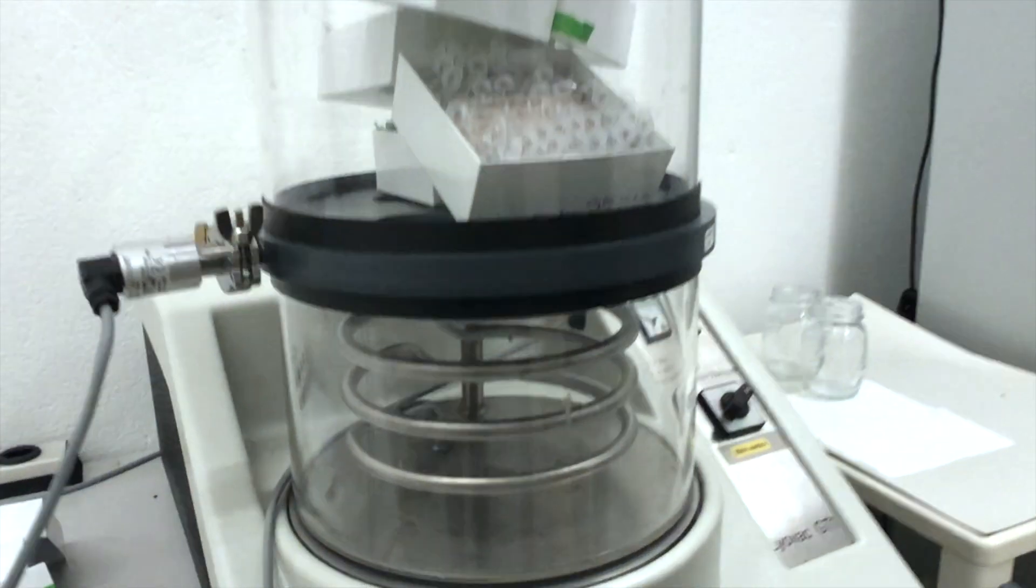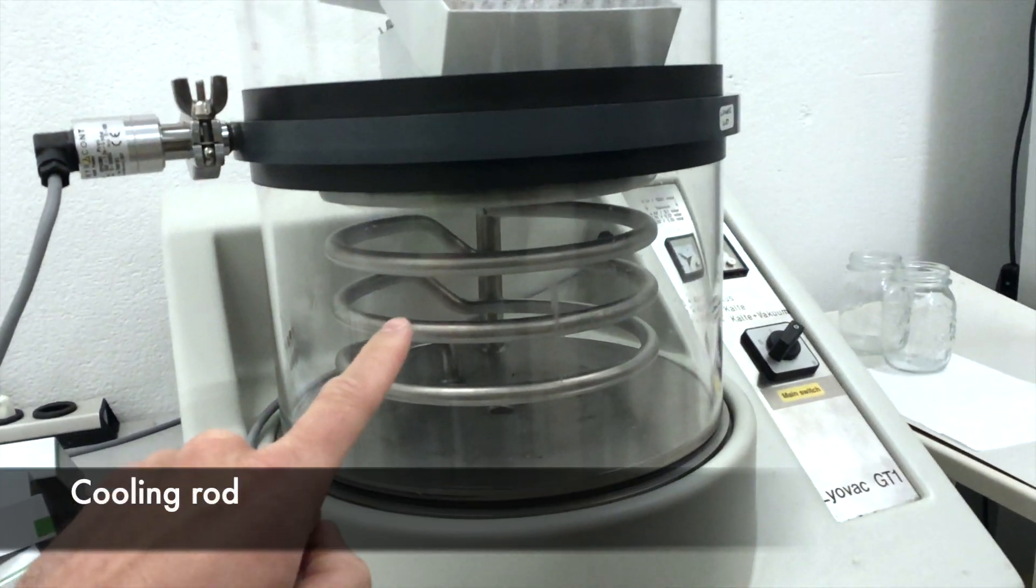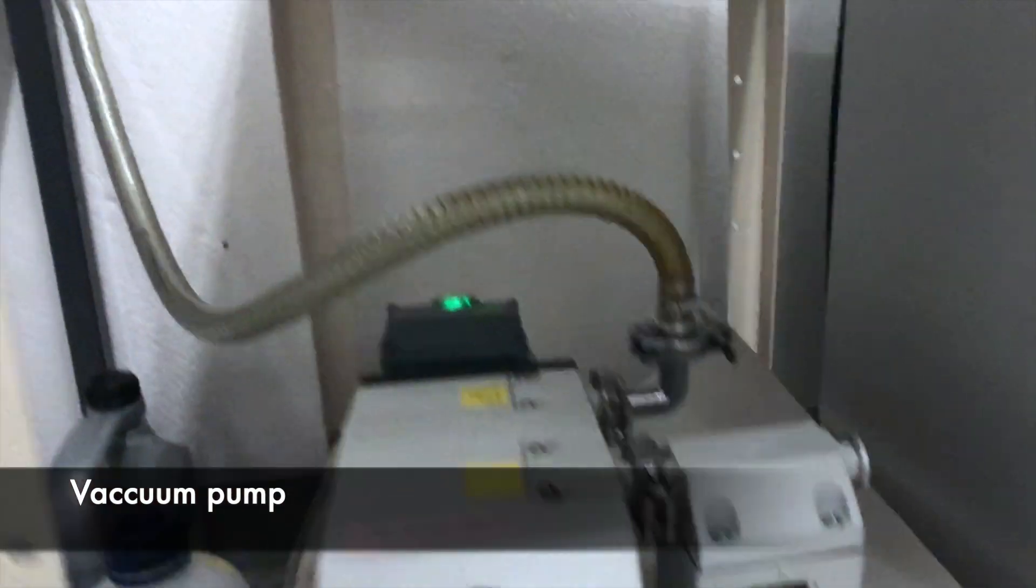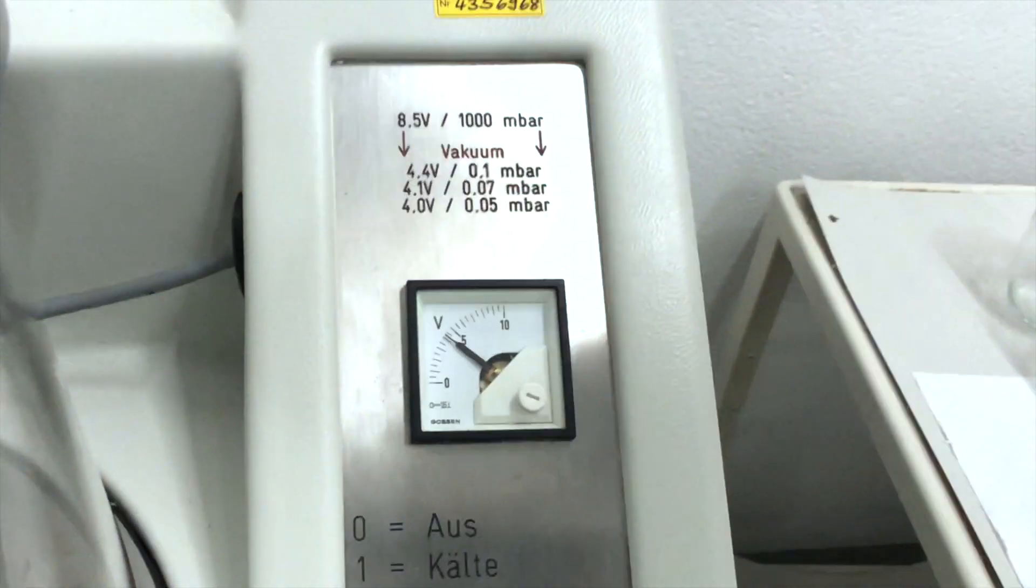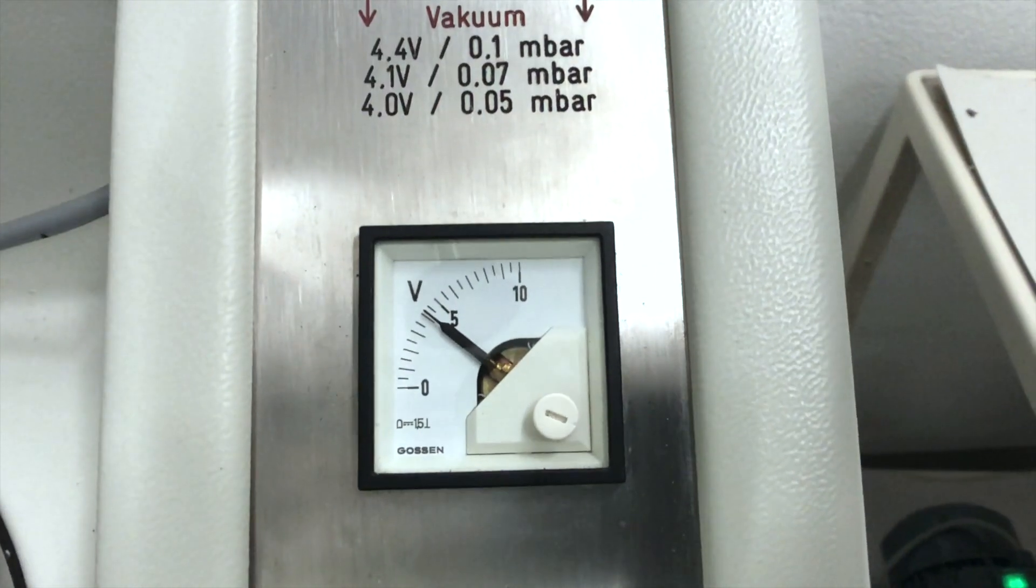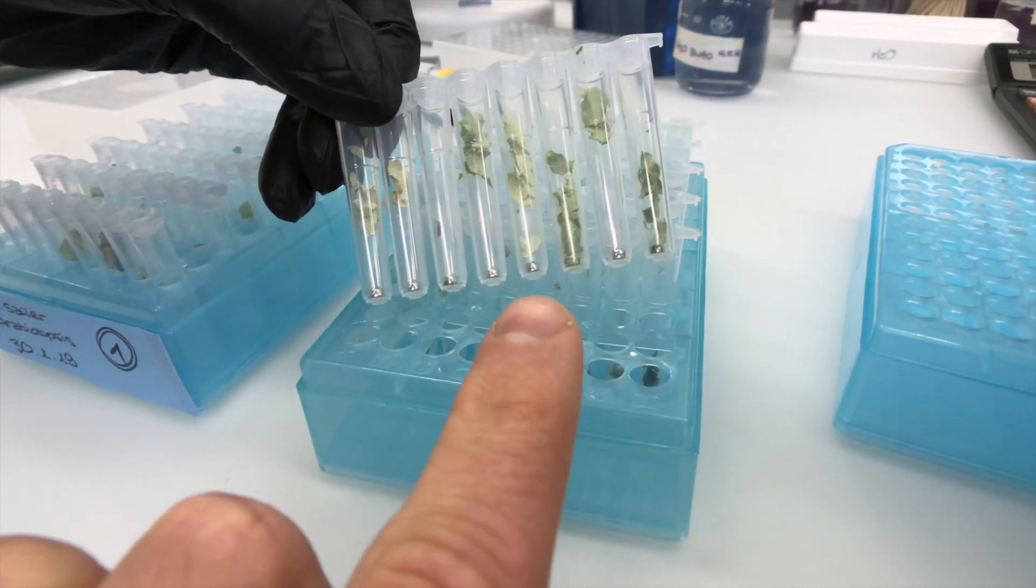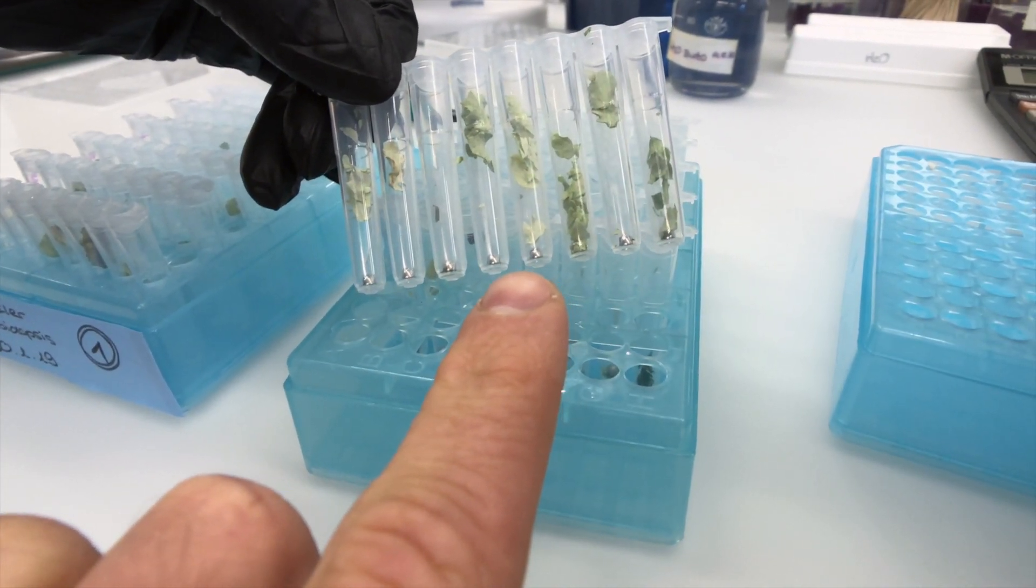Before we extract the DNA from leaves we freeze-dry them for easier handling. Freeze-drying is a very gentle method of drying materials. These beads are going to crush the leaves.